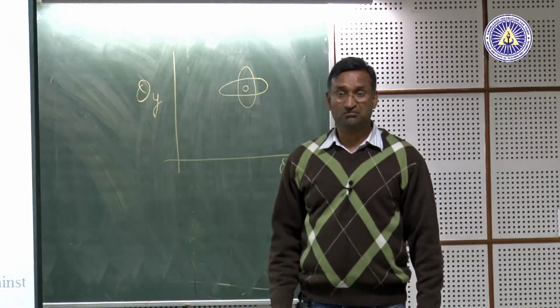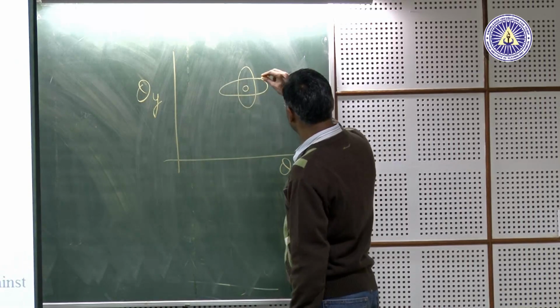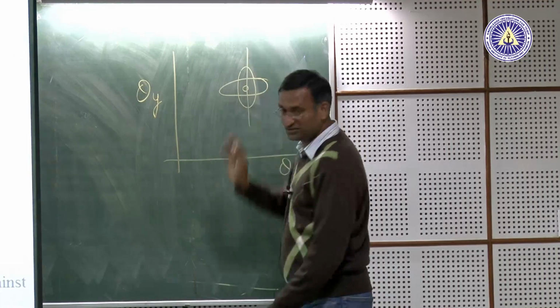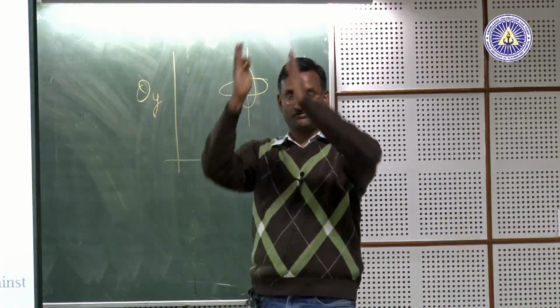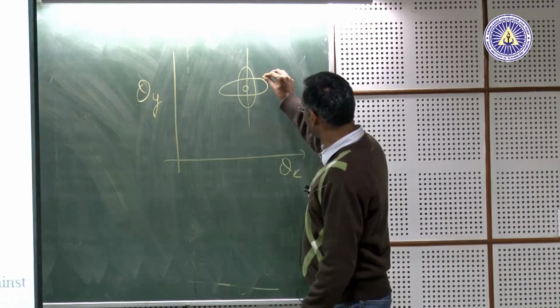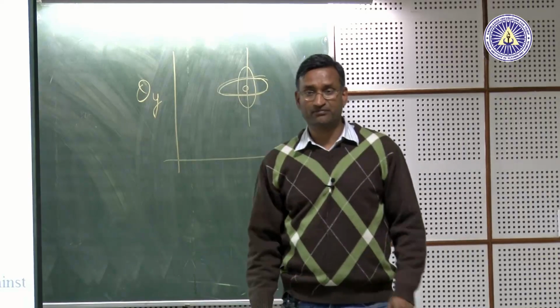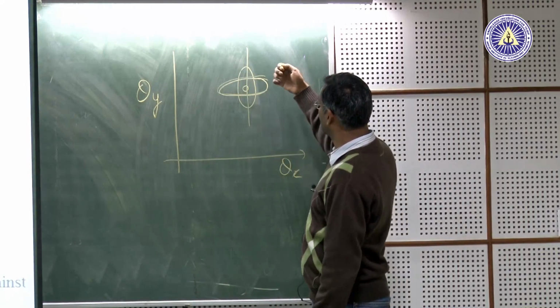So from an ideal picture perspective, this will correspond to the changes along, let's say, the perpendicular direction of the sample, which is along the film normal. This will correspond to the axis which is the in-plane axis of the thin film. What you are saying is also true in thin films.